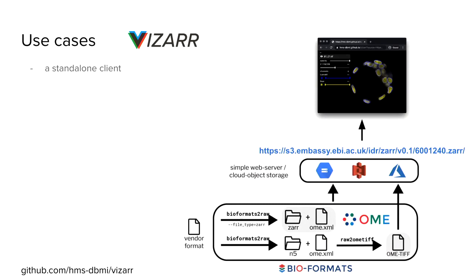The important thing to note here is that this is a link for the actual data set. If it was a TIFF link and you typed that into your browser, you'd start downloading some massive image. So it's a really powerful way, we found, to deconvolute where these data sets actually lie. If your cloud architecture supports this type of random access, then people can start sharing data sets via links, rather than links that go to another page where you eventually find the data set in question.